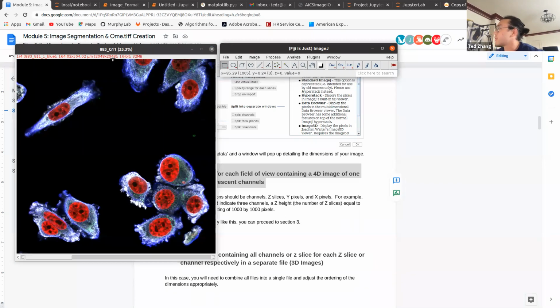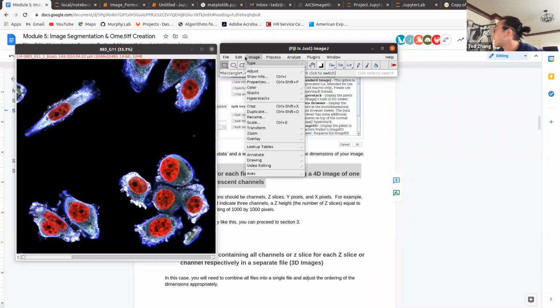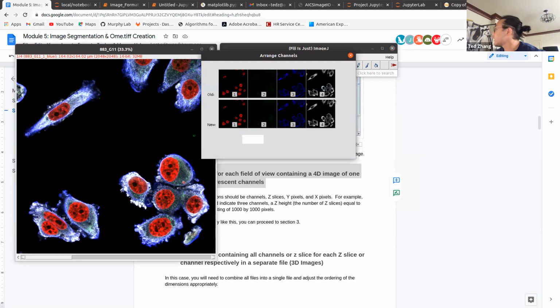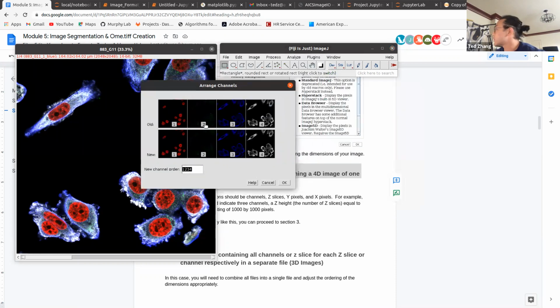Once you have your images like this, maybe for aesthetic reasons, you want to make sure that you have the red channel as red and the blue channel as blue. What you can do is use arrange channels. You see the first one, it should be blue, so we put it into a blue coloring.